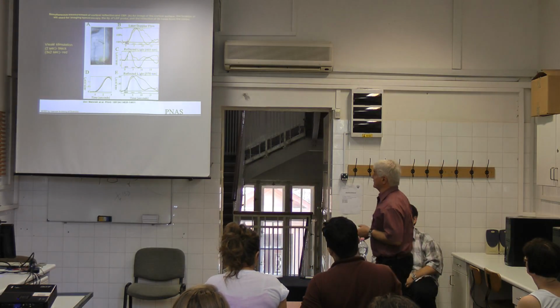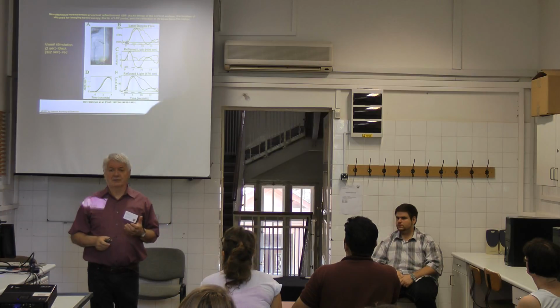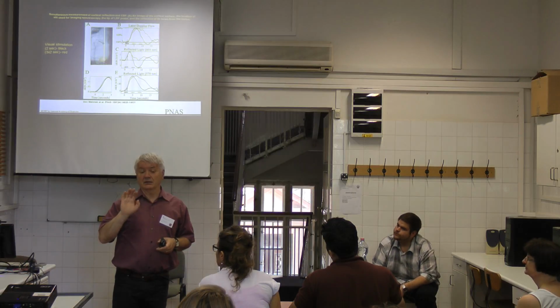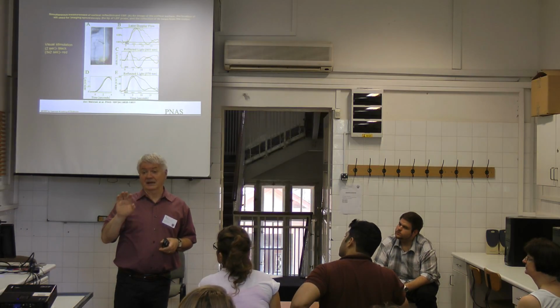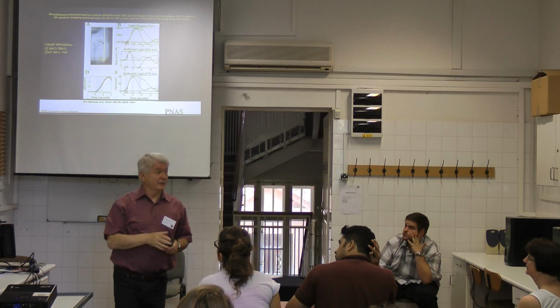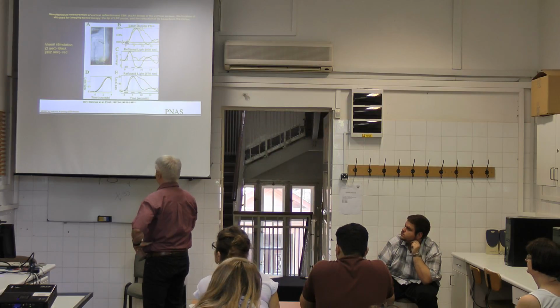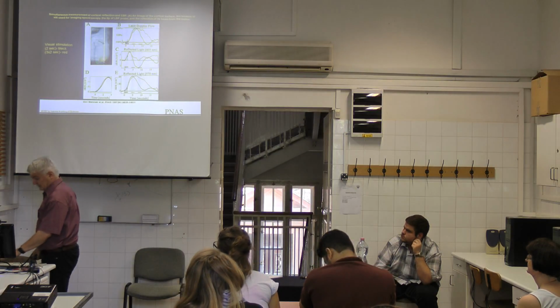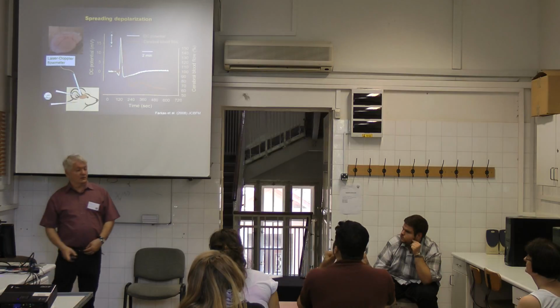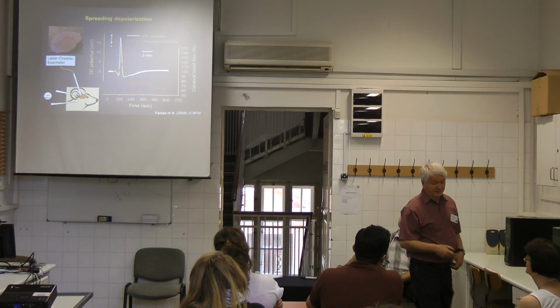And one good stimulus for the brain is light. Repeated light to the eye will elevate the blood flow in the occipital cortex. So therefore, if we check here, we can see not only the blood volume but also the reflection of the different colors. And these are our studies. I'd like to really show you what we are doing here in the laboratory.